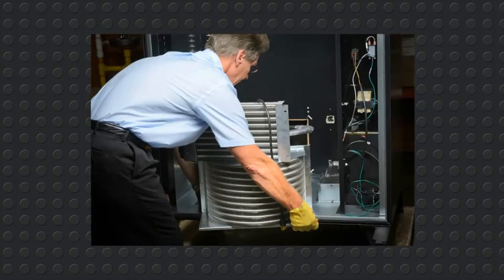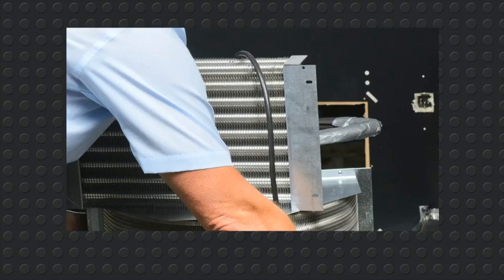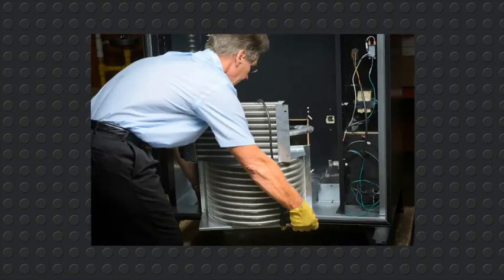We will now move the evaporator onto the top of the condenser. Be sure the IEC cover is safely out of the way. Clip the wire tie around the drain hose and move the drain hose off to the right. Place the power plug over the top of the evaporator. Grab the base plate and move the unit forward.